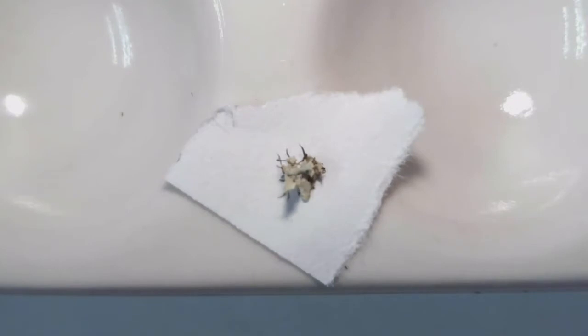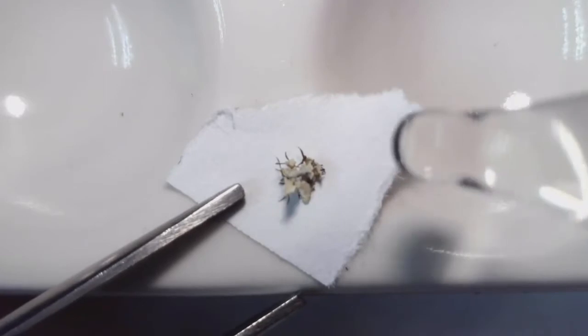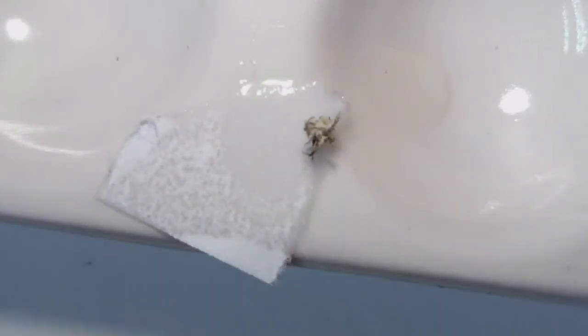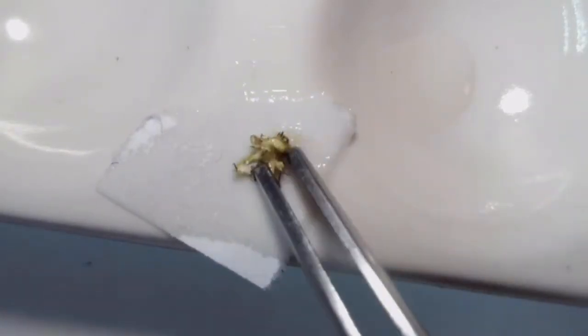And so in this case now it's the cortex that should react. And this is because of the presence of the substance called atranorin. And so again, we're just going to follow the same method. I usually hold the paper down because it can stick to the dropper. And I'll get my drop of K. Oh no, it fell over. That's okay. Maybe do it again. Getting to be a lot now.